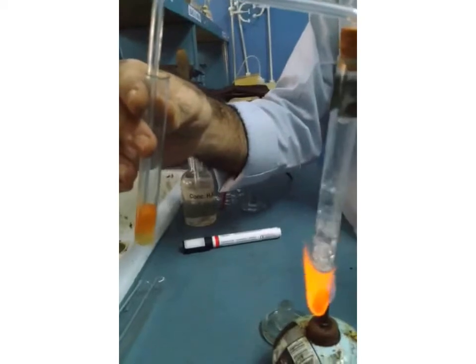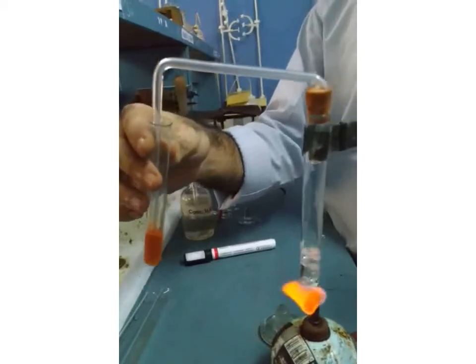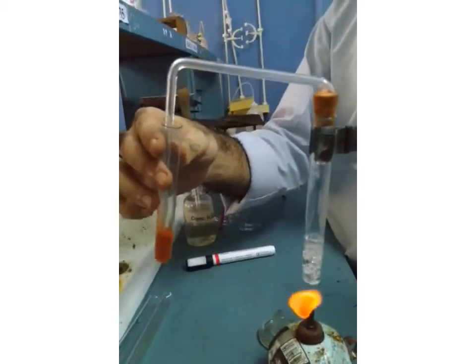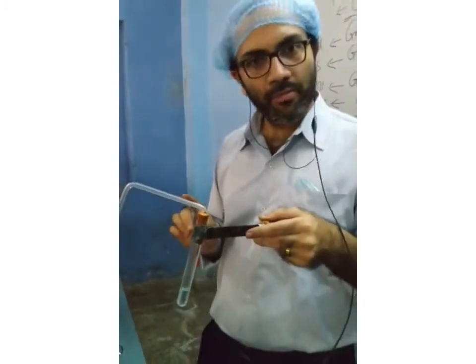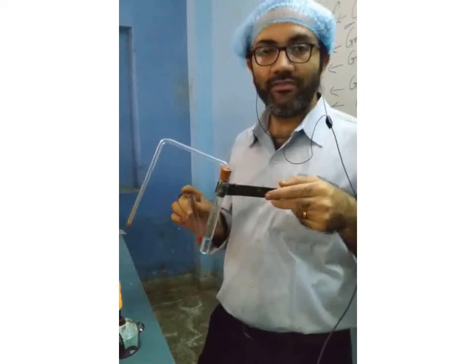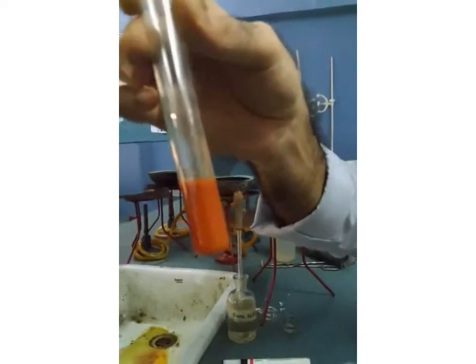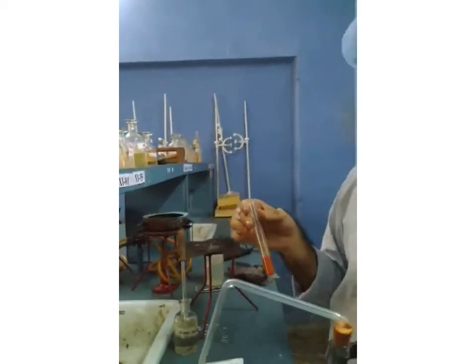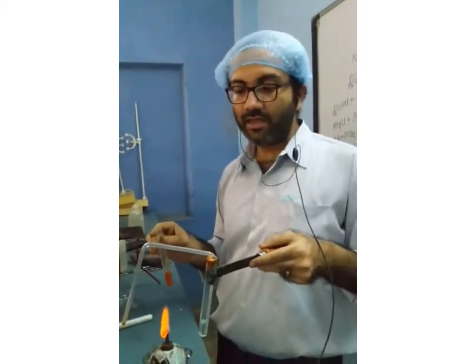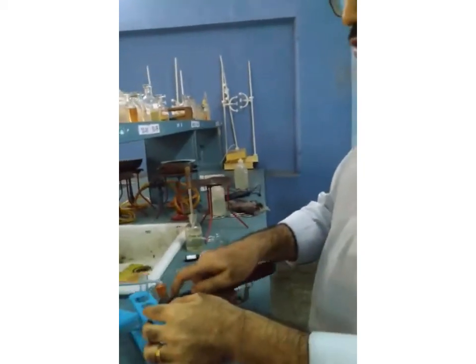You can check it out. The solution is turning brown. I hope it's clear to you. This gives a clear confirmation with Nessler's reagent, and hence confirmation that the ammonium ion, NH4 plus, is present inside this solution. That's a confirmatory test. This changeover from a transparent colorless solution to a brown solution is about Nessler's reagent changing its color, and the confirmation is that NH4 plus is present. That's a confirmatory test. We move on to the first identification of groups.